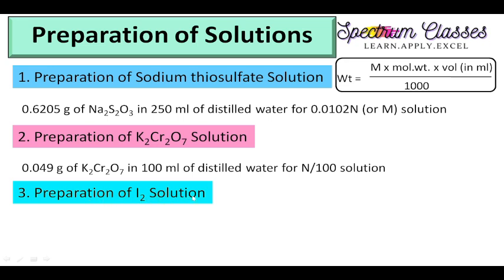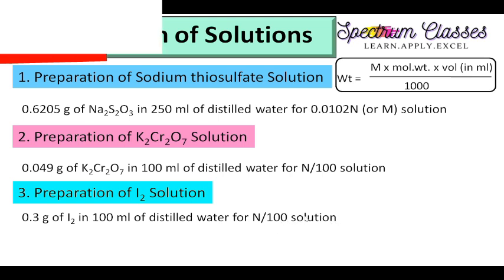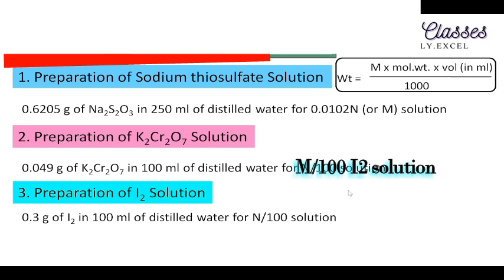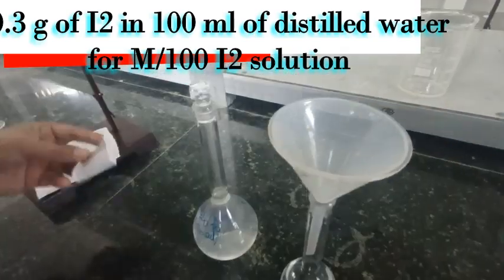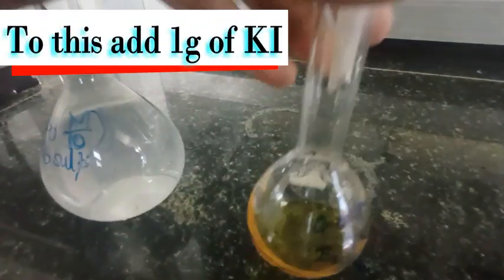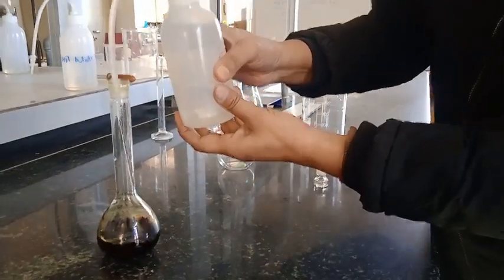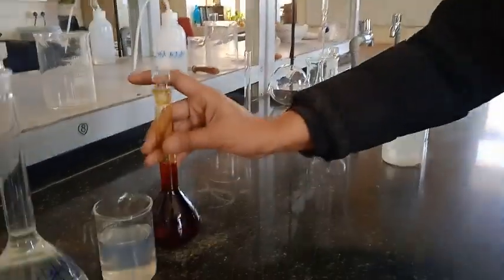The third step is preparation of iodine solution. To prepare iodine solution I need to calculate how much weight to take for 400 ml of distilled water to prepare an N/100 solution of iodine. Putting all the values into the formula, I get 0.3 grams of iodine. I have weighed 0.3 grams of iodine and attempted to dissolve it in distilled water, but as you can see it does not dissolve in simple distilled water. So I added 1 gram of potassium iodide to dissolve it — you can see it started dissolving. I added small amounts of water gradually so it dissolved completely; it takes 2-3 minutes and now the solution is ready.